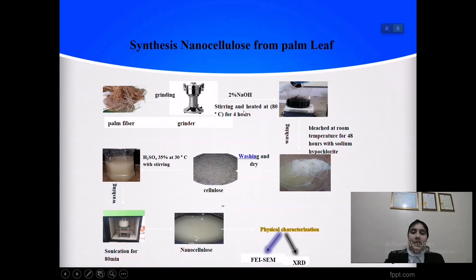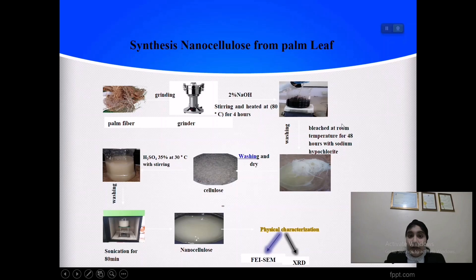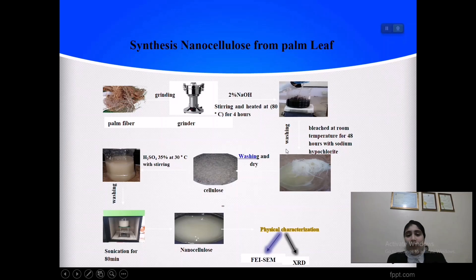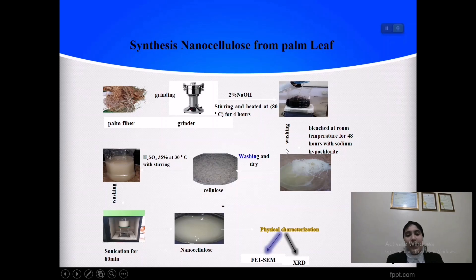Then we add 2% NaOH, stir and heat at 80°C for 4 hours. After that, we wash it again and bleach it at room temperature for 48 hours with sodium hypochlorite. We wash it once more, and then we obtain cellulose.